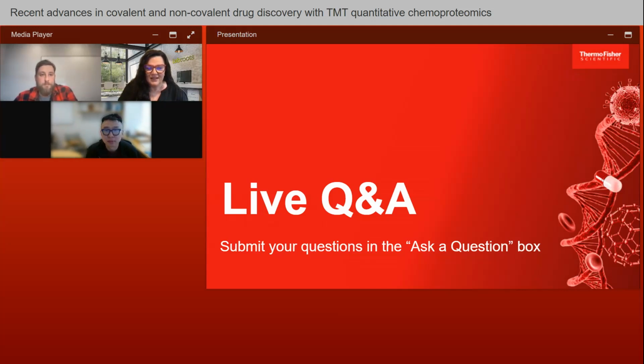Right, fantastic. Our next question: at what stage of the drug discovery pipeline are CETSA experiments most frequently used? Compound library screening, hit validation, or mechanism of action?